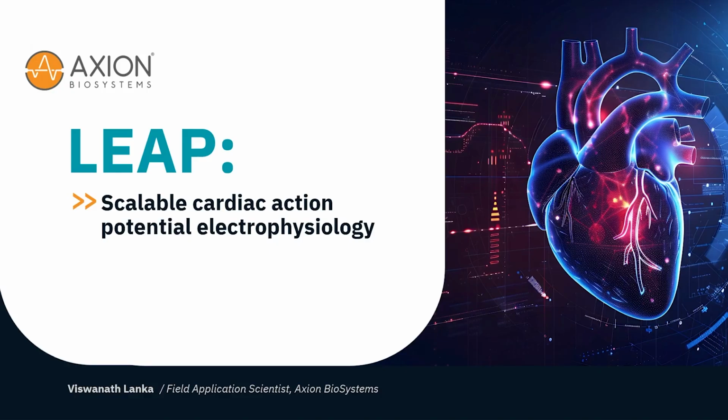My name is Vishwanath Lanka, and today we're going to talk about LEAP, Axion's local extracellular action potential capability on the Maestro MEA platform. The focus of this talk is simple. How can we bring action potential-like insight into a scalable MEA workflow?